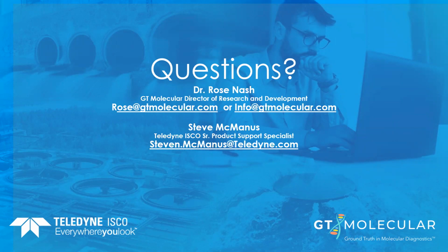Teledyne ISCO does have a variety of flow monitoring equipment that would again depend upon the application conditions that we intend on monitoring in. That will help determine what is the most suitable option to select. And then there is also, beyond the hardware, there is a requirement to have some understanding of what the typical volumes would be in that application to be able to devise a pacing routine around that given volume.